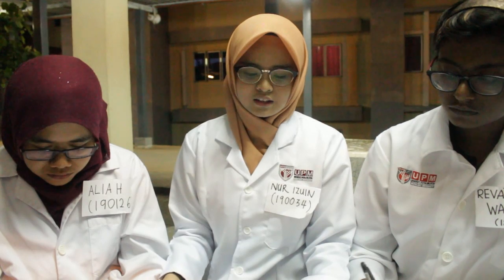Lastly, for the detector, the detector plays a role in changing the light transmitted from a sample into an electric signal. Examples of detectors are optical semiconductor and photomultiplier. I will pass to next.